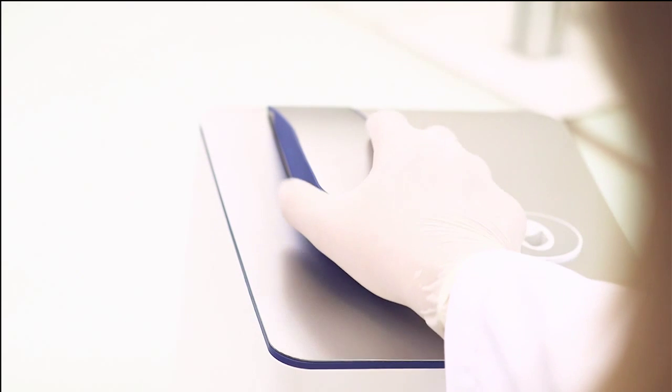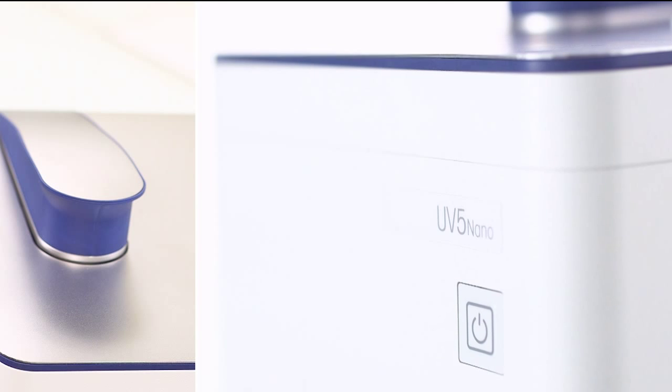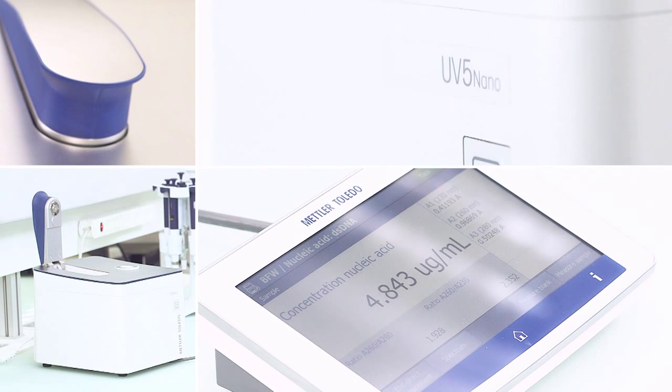During the measurement, the arm cannot be moved as it is securely locked by magnetic attraction. The UV5 Nano automatically selects the optimal measurement and displays the result.